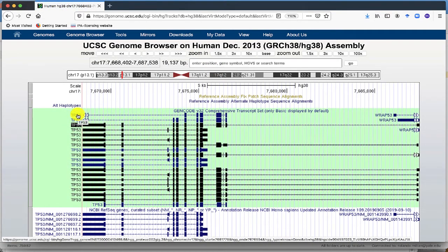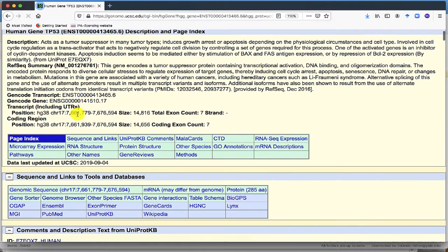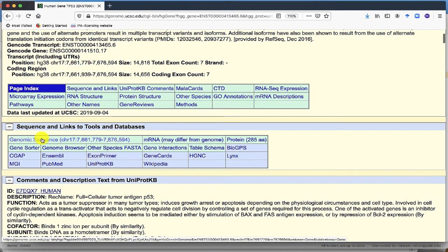Click on the name of the gene, scroll down and click on the genomic sequence of the gene.